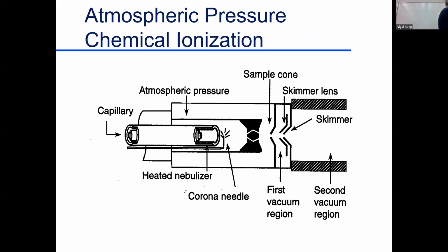This is another system. It's very, very similar to the other one. And so here we have, in this case, a capillary tube coming in. The whole thing's under atmospheric pressure. Here we have something like 7,000 volts. So anything that's being drawn in goes through the capillary tube. They use these types of mass spectrometers to go up in balloons and sample the atmosphere, or go around the city monitoring pollution, because it's drawing samples from the environment in here. And it charges in here, gets the ionized molecules to come out here, going to the mass spectrometer. So this is a nice technique.